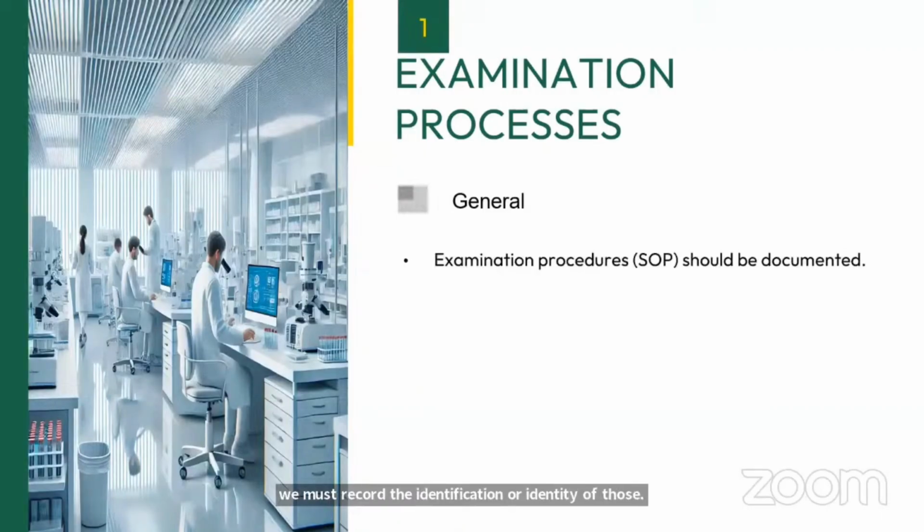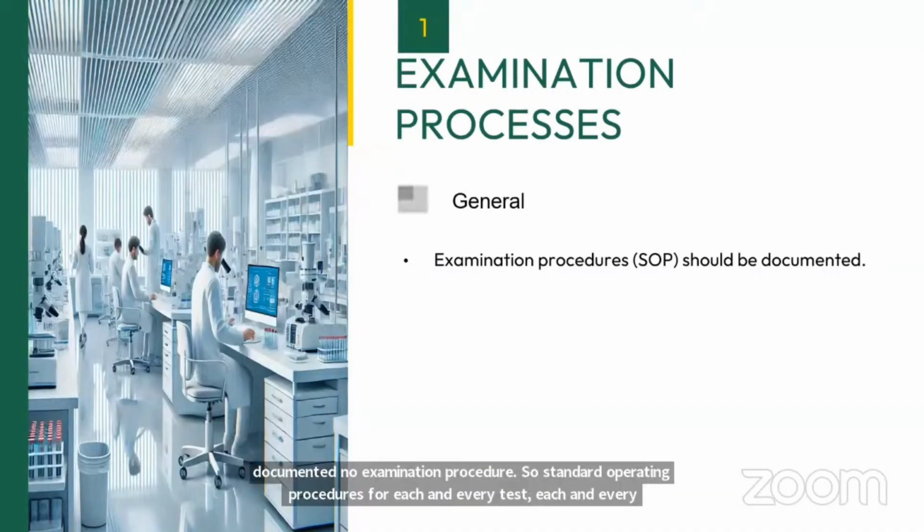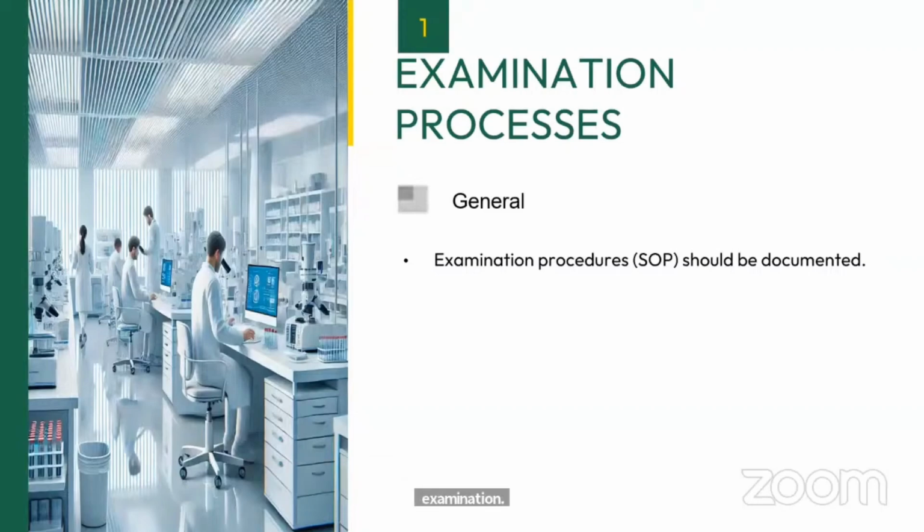Apart from that, the examination procedure should be documented. Examination procedure means standard operating procedure. Standard operating procedures for each and every test, each and every examination, should be documented. In the previous lecture I mentioned why it should be documented: so that you can train all your personnel and all your staff on those SOPs. Whoever is performing a particular test, maybe some ABC person today, XYZ person tomorrow, somebody else the day after tomorrow, the consistency remains the same.